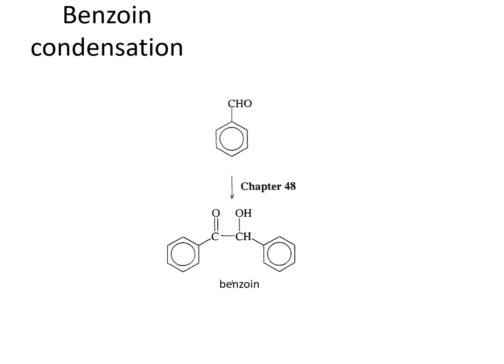We'll be using benzaldehyde, and our destination is to synthesize benzoin. It's a compound with two six-membered rings having both a carbonyl carbon and a hydroxyl group in it, and you'll see how we will synthesize it in detail.